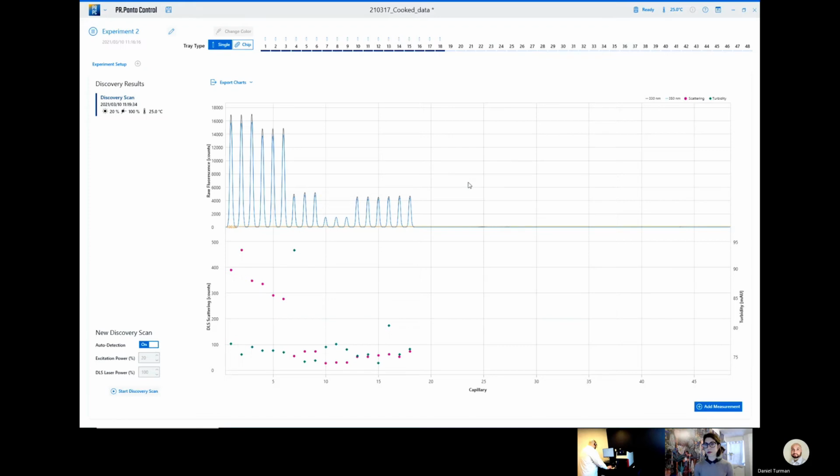So we can already see there's a difference in the total fluorescence output. But as long as we are between 100 fluorescence counts and 20,000 fluorescence counts, we're going to get perfect data. And that's a very large range. The dynamic range of the instrument is, in this case, an order of magnitude in concentration, but you can go much further. And you also have the ability to look at different conditions that may dull your fluorescence.